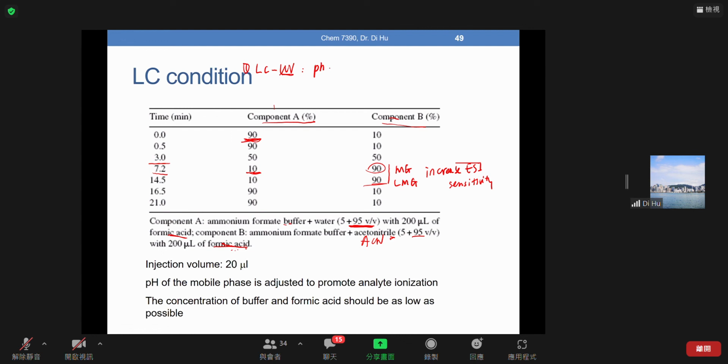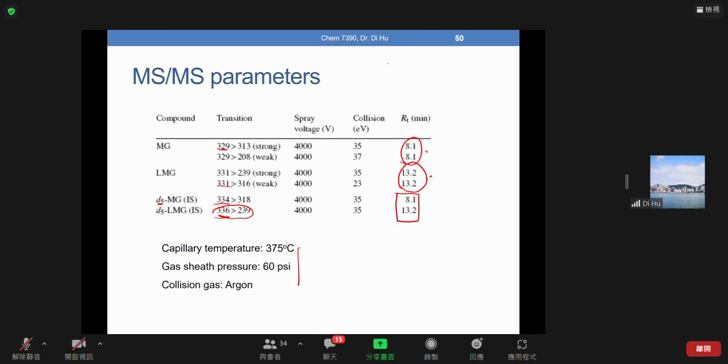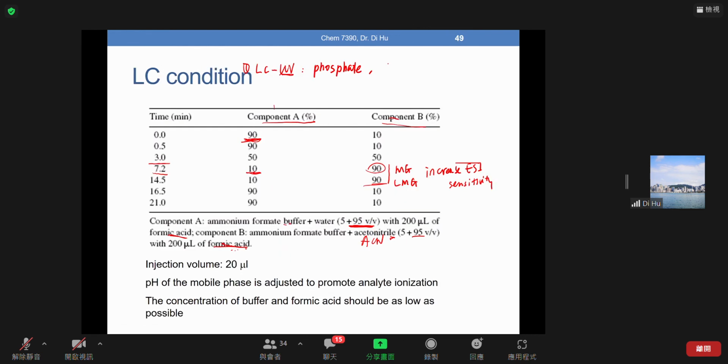So when we're using the phosphate buffer, the additive for that one is pretty widely used, and also the acetate buffer is often used as well. The phosphate buffer has multiple ranges, because it depends on how many hydrogens you have, right? Because we know phosphoric acid is H3PO4, so it has 3 pKa values.